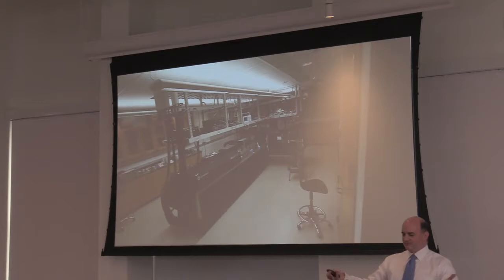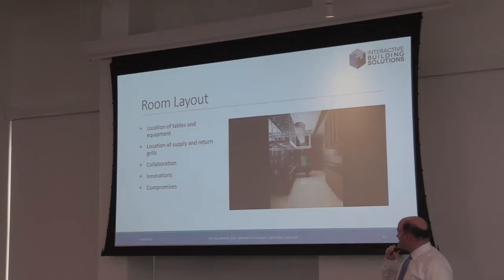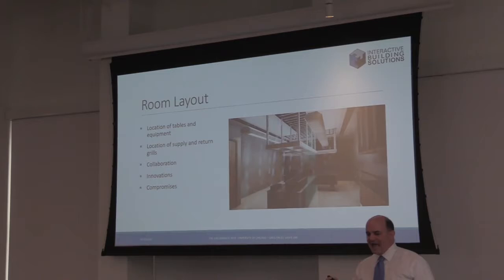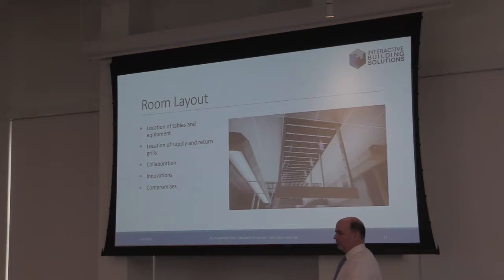And then you've got $1.5 million of equipment sitting on the top. You also have all your chillers and heat-producing appliances in a separate air-conditioned, soundproof space. Also, where you can lock your students if they misbehave. And it works really well. This idea of putting the air down around the sides and pulling it up through the center is exactly the opposite of what you would do in a surgical theater. It's just absolutely not what you do in what I would call the second most controlled space that you might typically find.